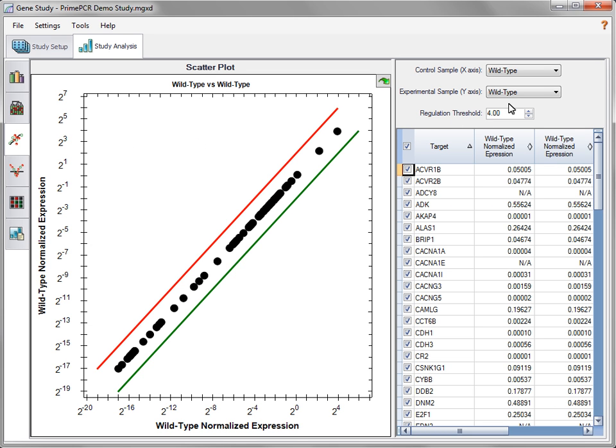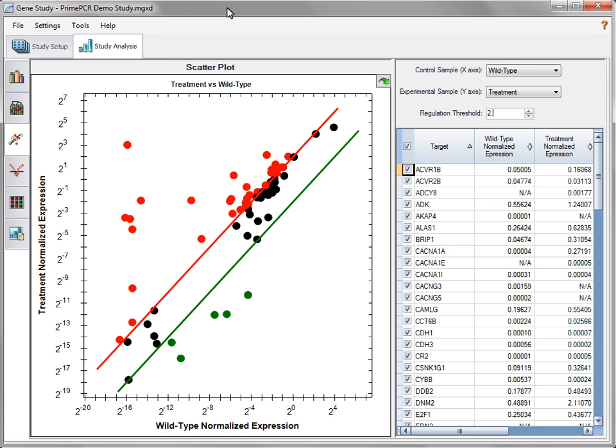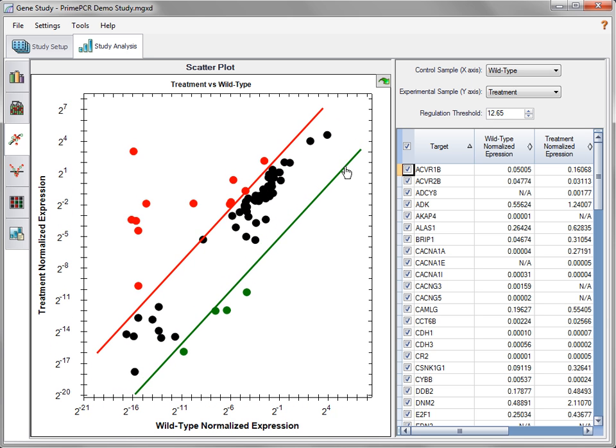The scatterplot displays the normalized expression of an experimental sample versus a control sample. In the plot, data is color-coded based on whether there is an increase or a decrease in expression for a target in the experimental sample relative to the control sample based on the position of a threshold. Increased relative expression or upregulation is indicated by red, decreased relative expression or downregulation by green, and no change in expression by black. Select the appropriate samples for analysis using the drop-down menus. Adjust the regulation threshold by entering a value in the box or clicking and dragging the threshold bars within the plot.